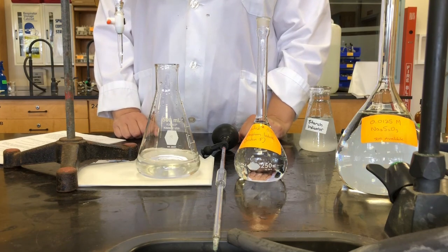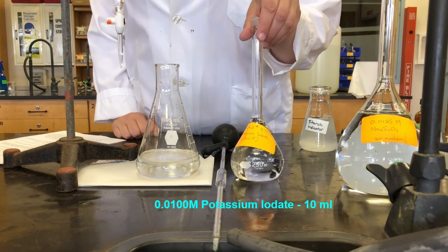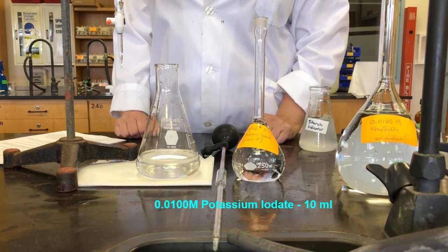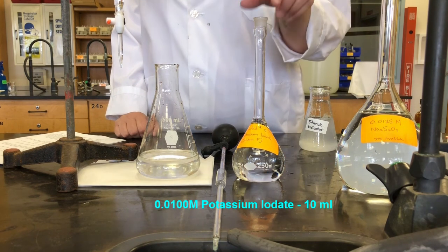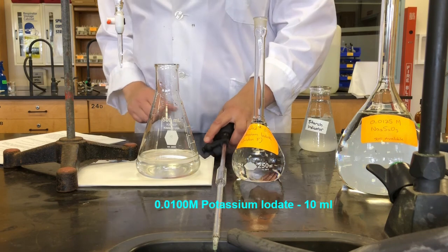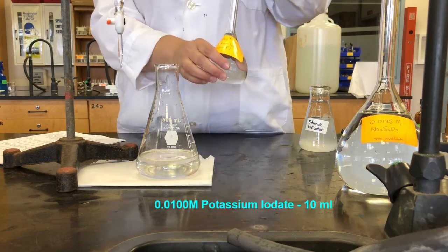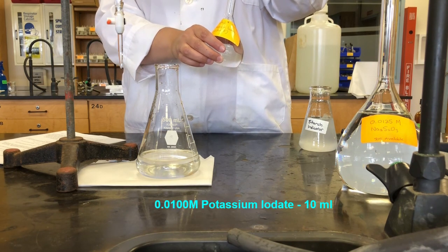So after the indicator solution, now we're going to add our potassium iodate solution. So this is a diluted potassium iodate solution. So we started with our stock solution, which was solution F, and I diluted that down to 0.0100 molar. Okay. So I took 25 mLs of the original solution and diluted it down in a 250 mL volumetric flask to give us a 0.0100 molar solution. So now I'm going to take 10 mLs of that and add to our flask. I'm using a volumetric pipette again to do this. So we want to keep our volumes very accurate.